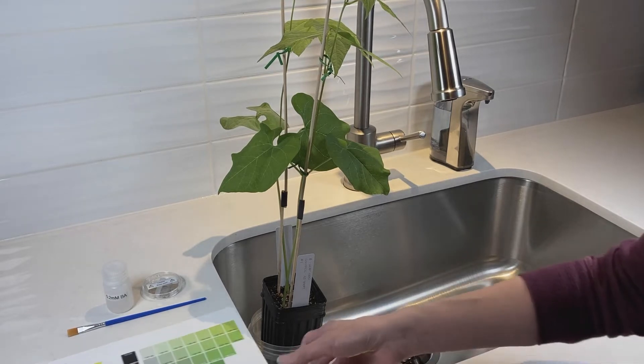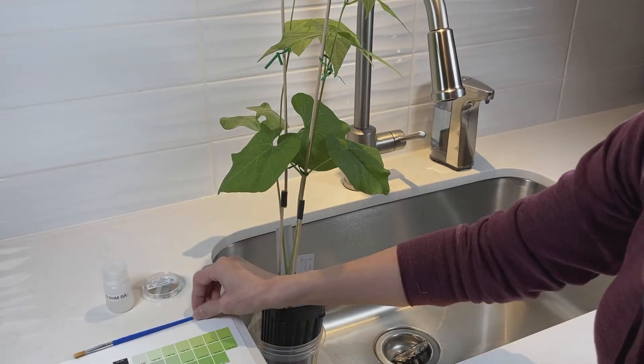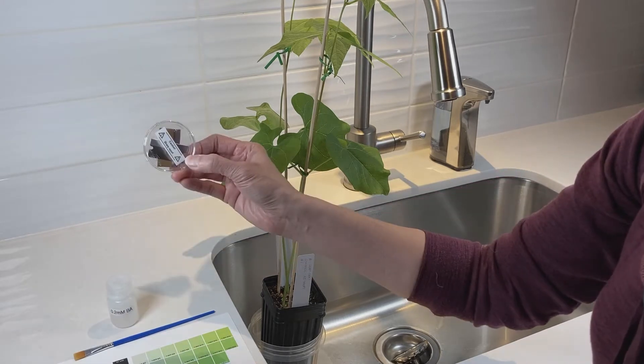For leaf senescence you're going to need the Munsell color chart, you will need the paintbrush, and your BA solution, and you will need razor blades.